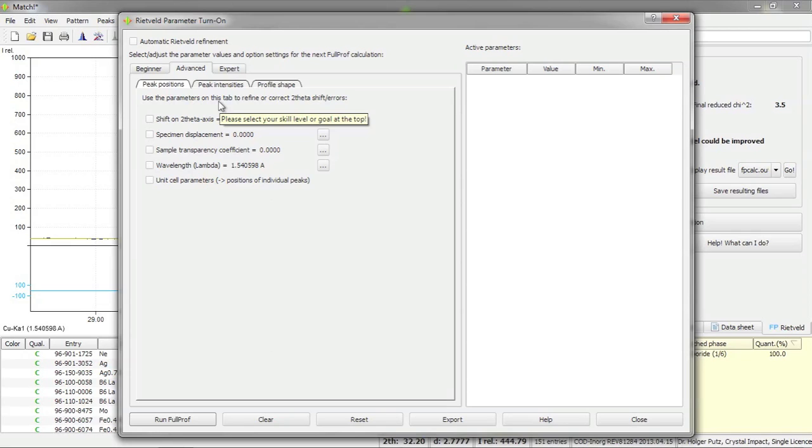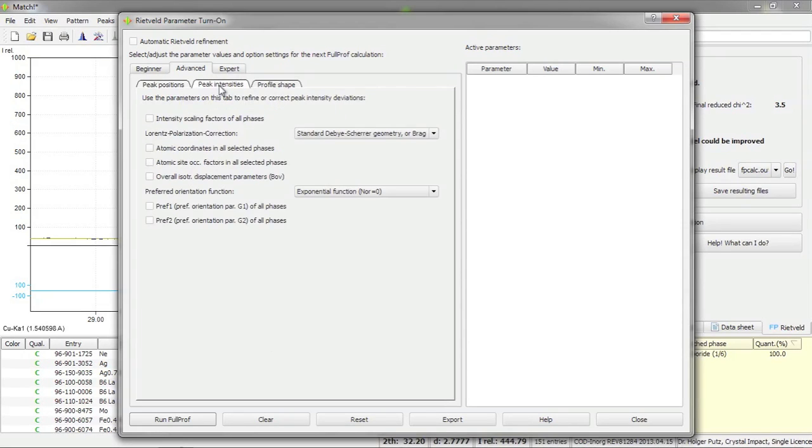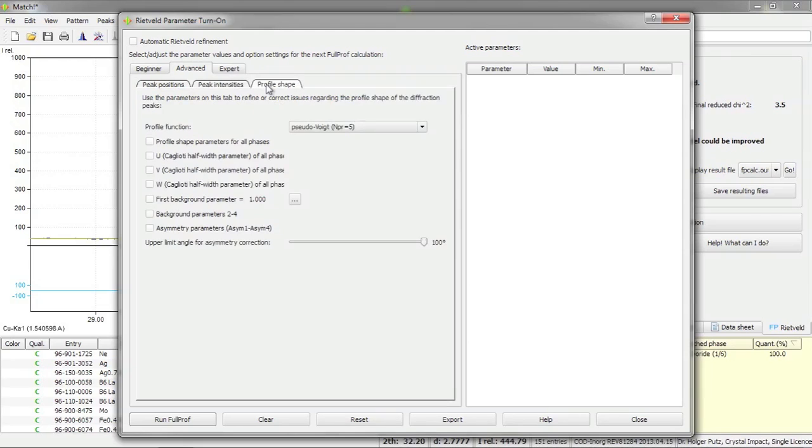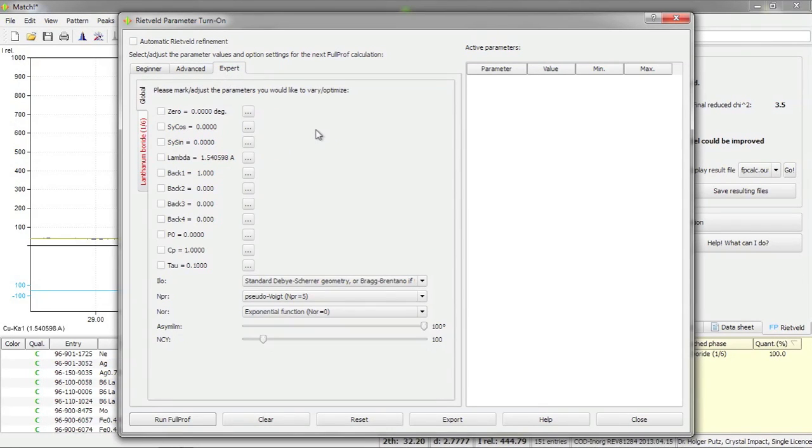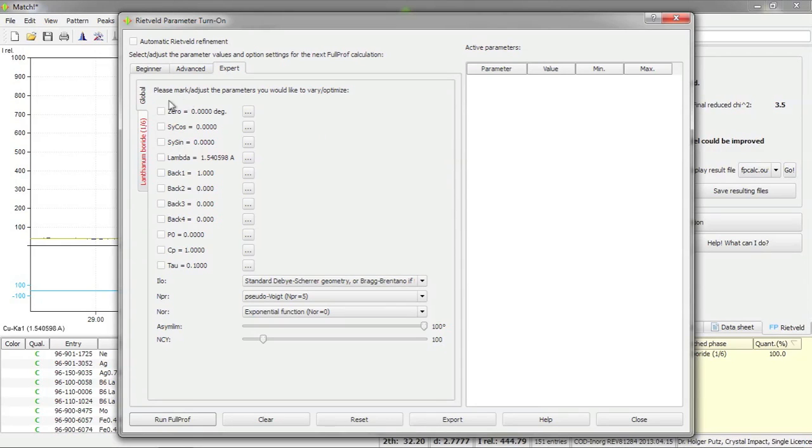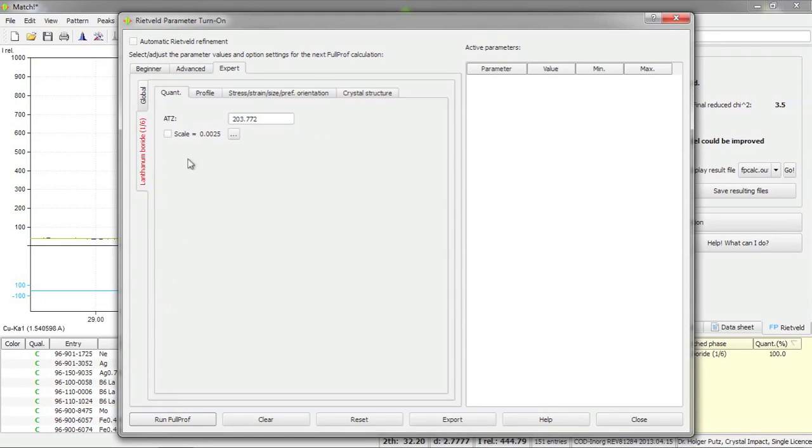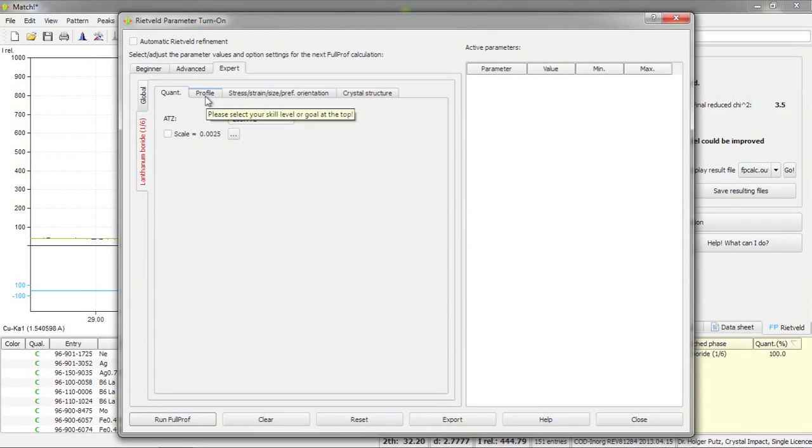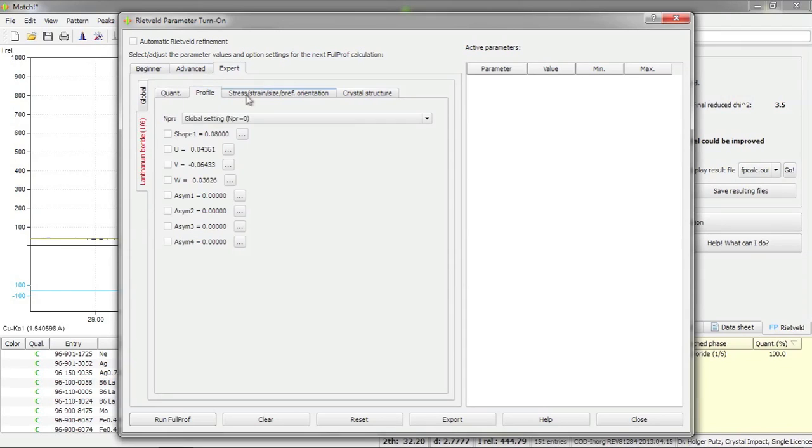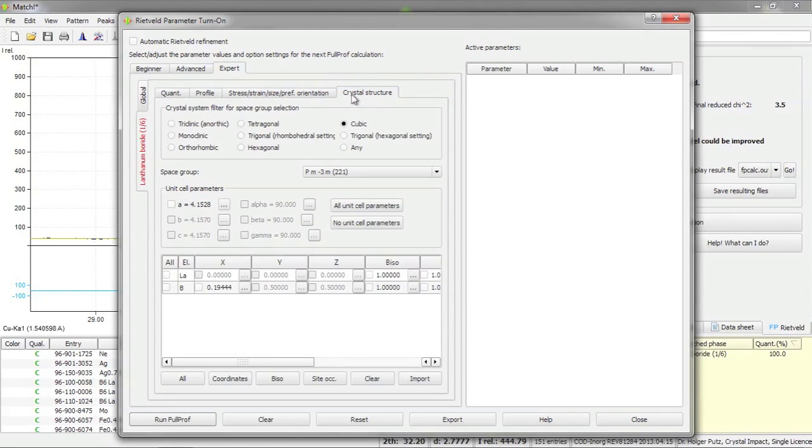On the advanced tab you will find the parameters grouped according to the effect they have on the diffraction pattern, for example according to peak positions, peak intensities and the profile shape. Finally we have the experts tab where you have access to all parameters. There is a certain subdivision according to global parameters and parameters that are specific for a certain selected phase. For each selected phase we again have subtabs on which the parameters are grouped according to quantitative analysis, profile shape, stress strain analysis and the crystal structure.